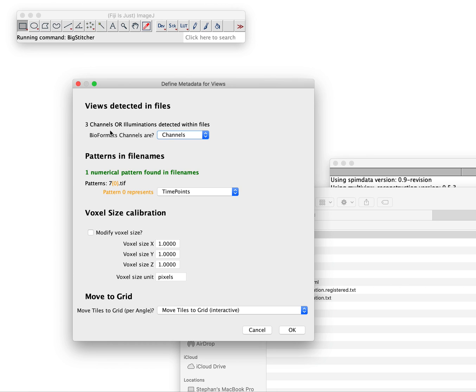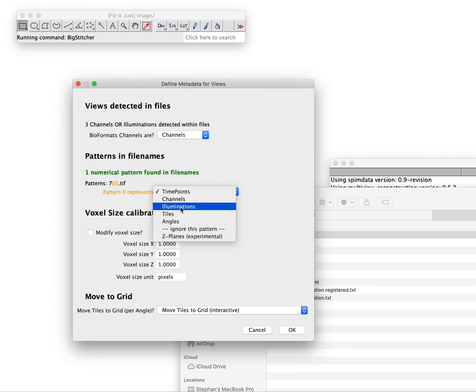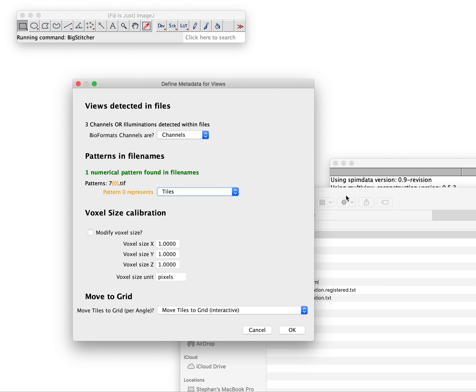It asks us there are three channels or illuminations within these files. Bioformats detect that. It is channels, it's not illuminations, and there's one numerical pattern it found which is here and each of them is actually an image tile. We have to tell them that it's an image tile.